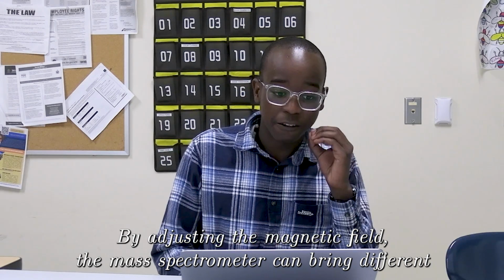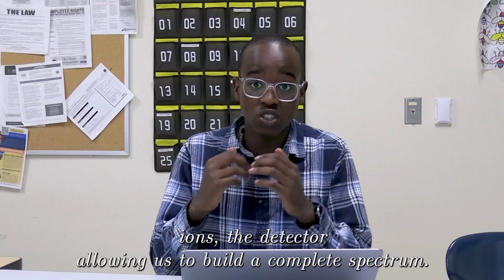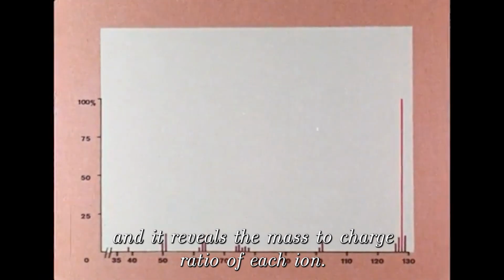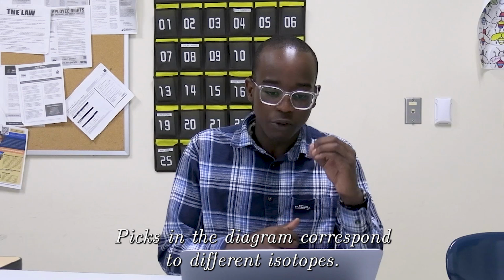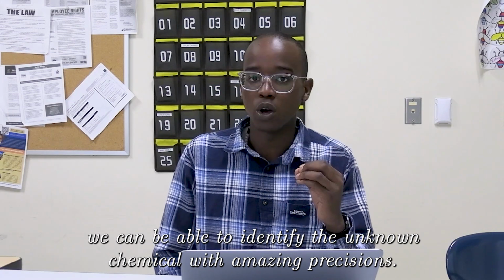By adjusting the magnetic field, the mass spectrometer can bring different ions to the detector, allowing us to build a complete spectrum. The spectrum is shown as a stick diagram, and it reveals the mass to charge ratio of each ion. Peaks in the diagram correspond to different isotopes. With this spectrum, we can identify the unknown chemical with amazing precision.